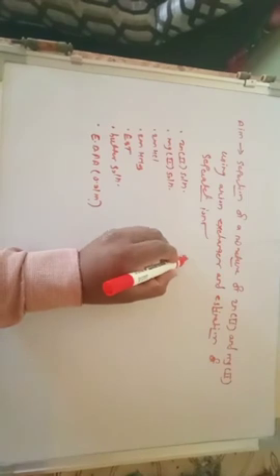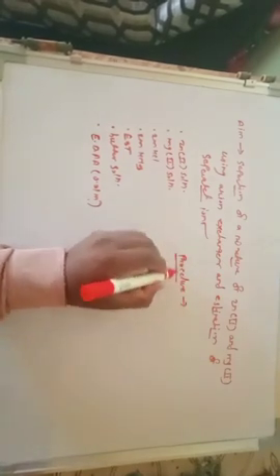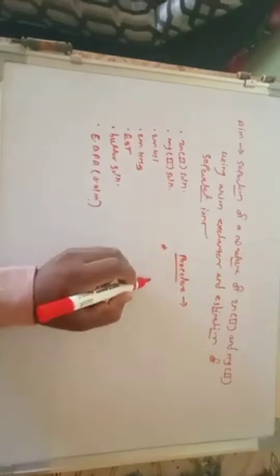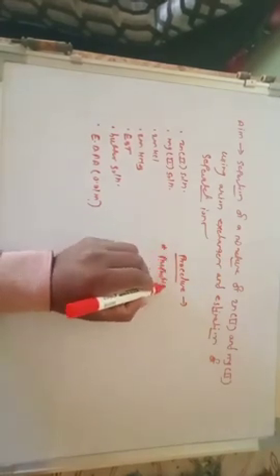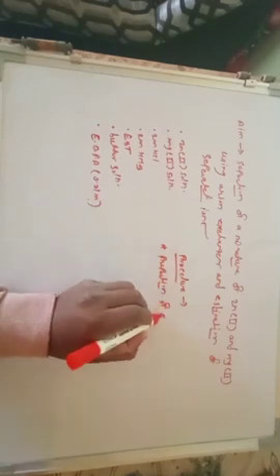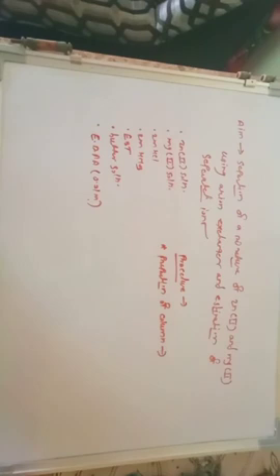Let us discuss the procedure. First is the preparation of the column.